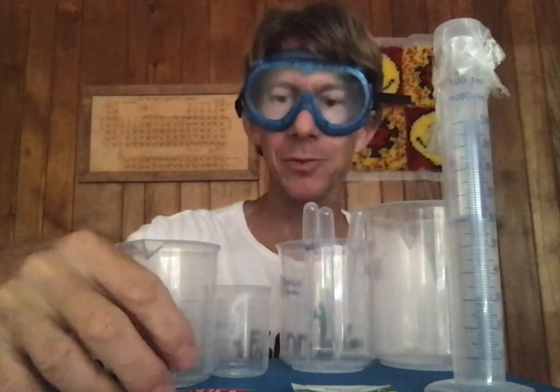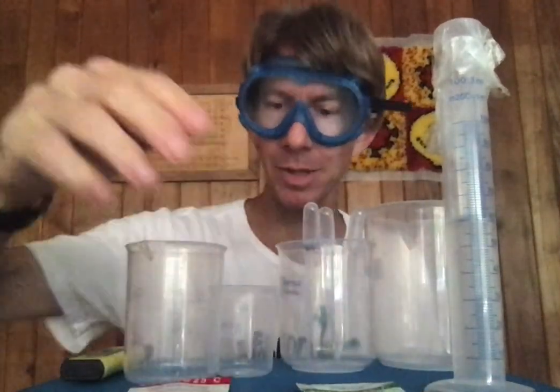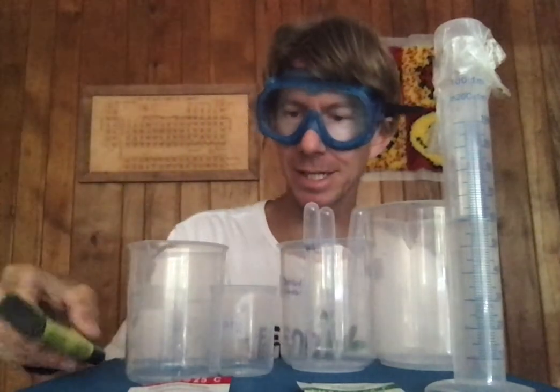Now, as the first part of running the lab, I actually calibrated my pH probe using the two pH buffer packets that came with it.